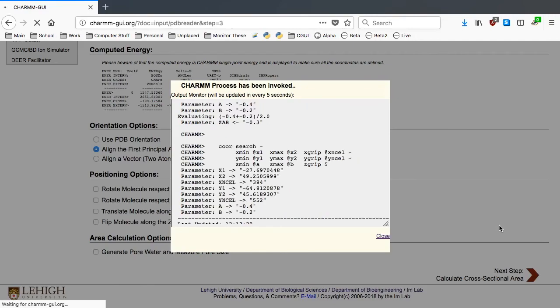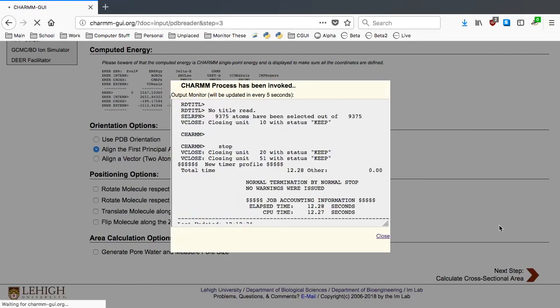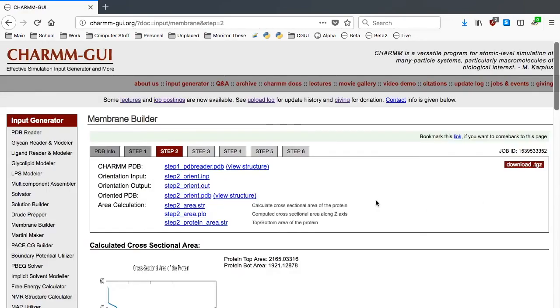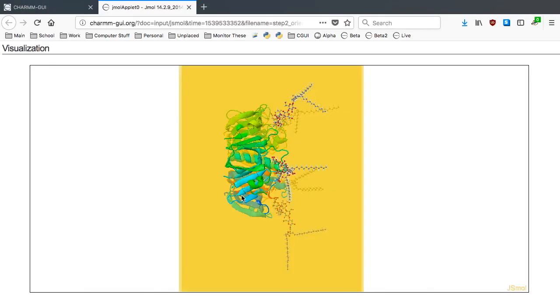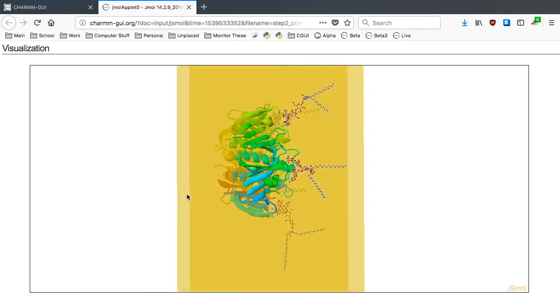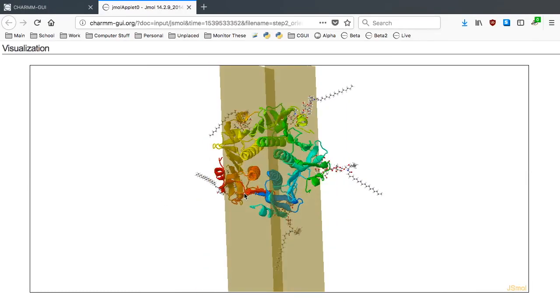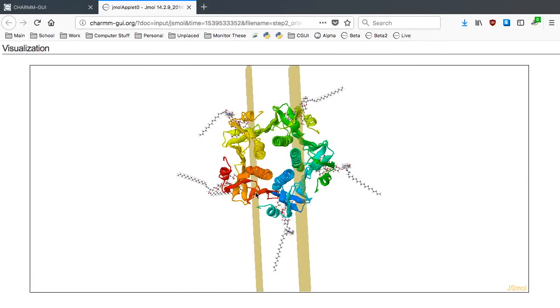Since we have no idea where this aligned structure will be located with respect to a bilayer centered at Z equals 0, we need to first click Next Step. Click the View Structure link of the oriented PDB to see how our model is oriented in a bilayer.